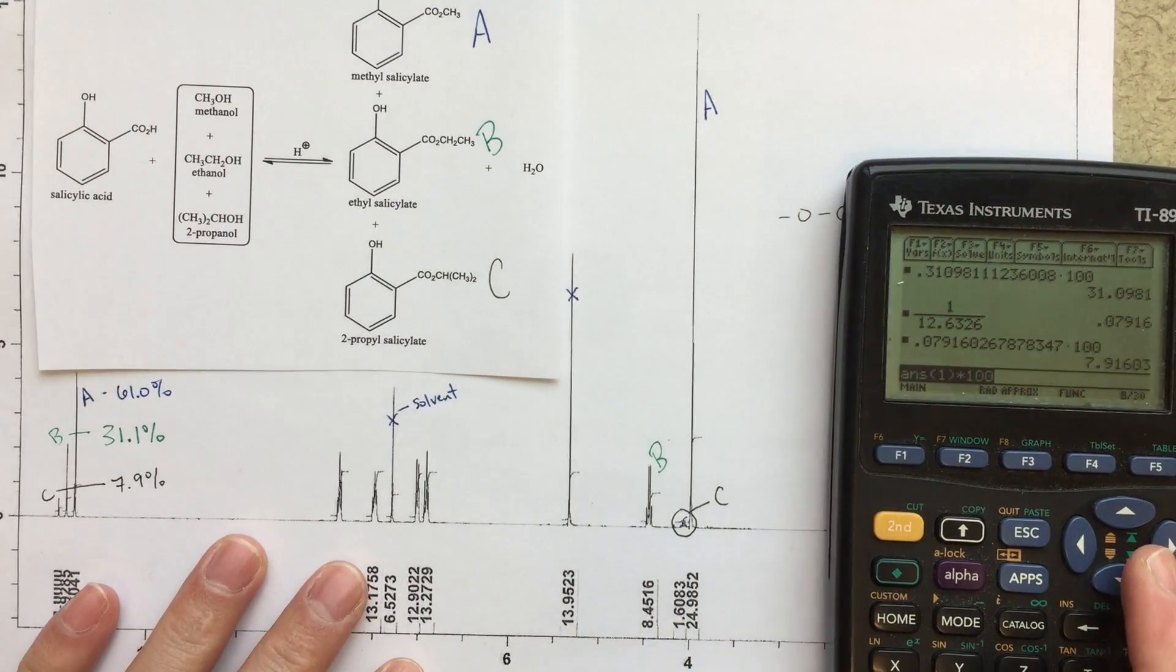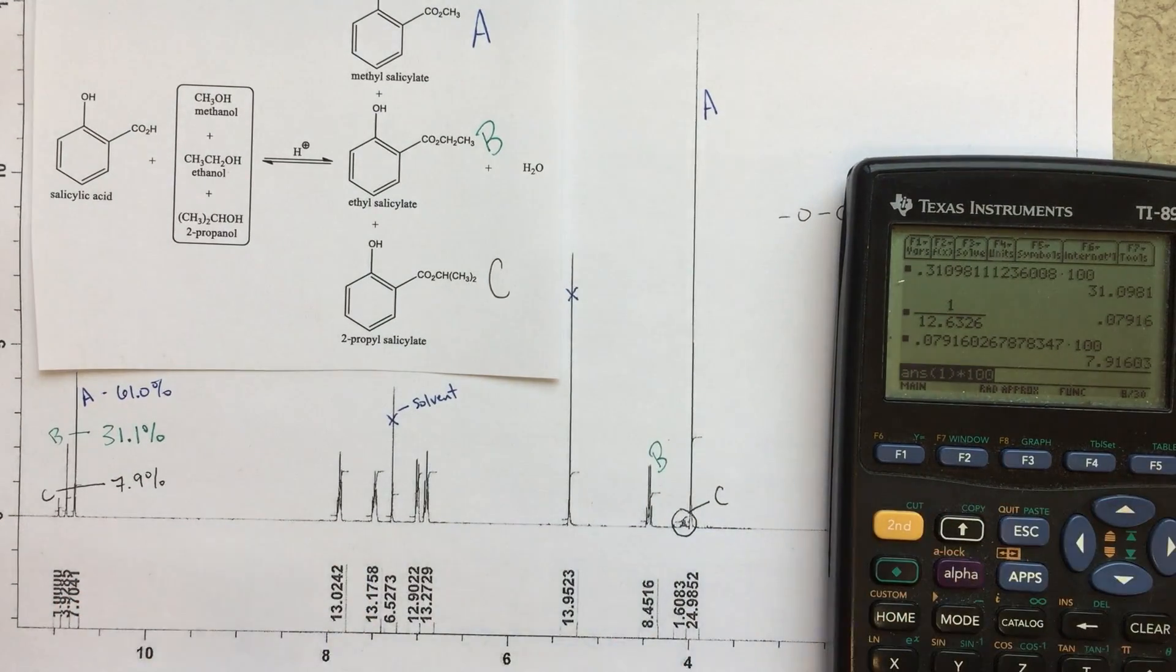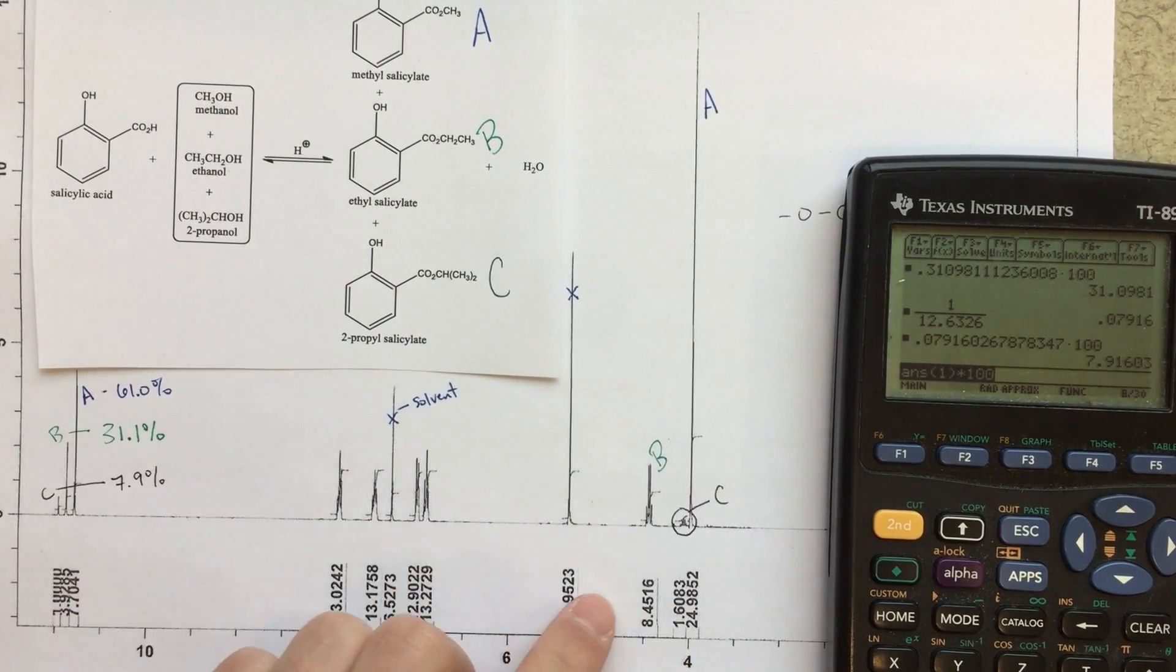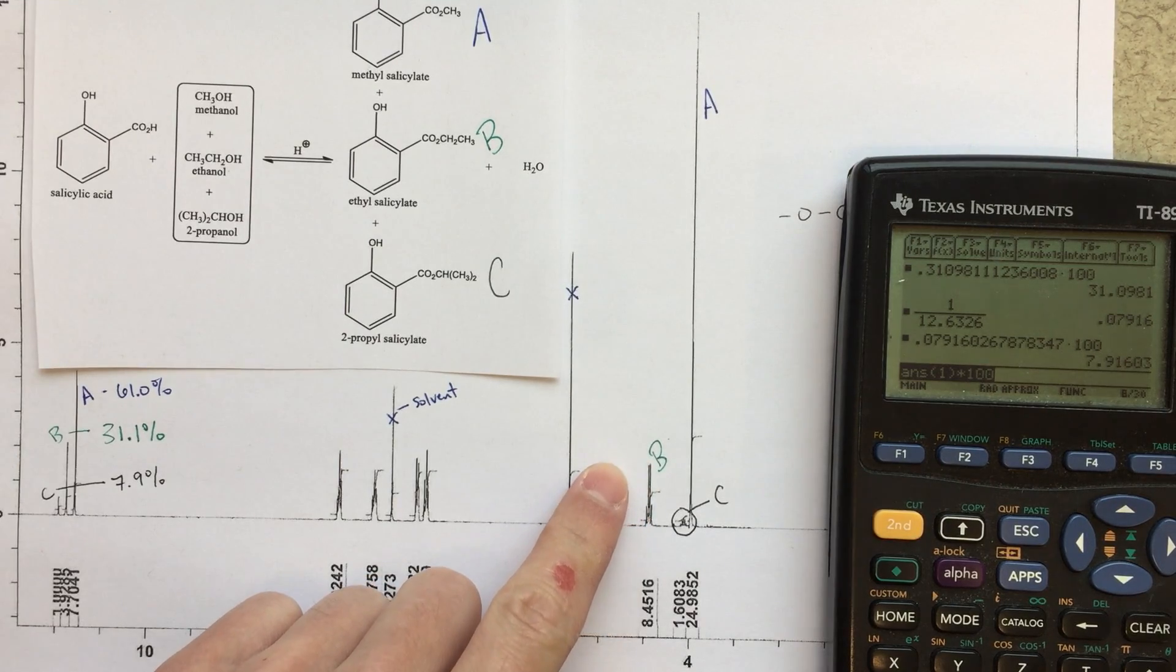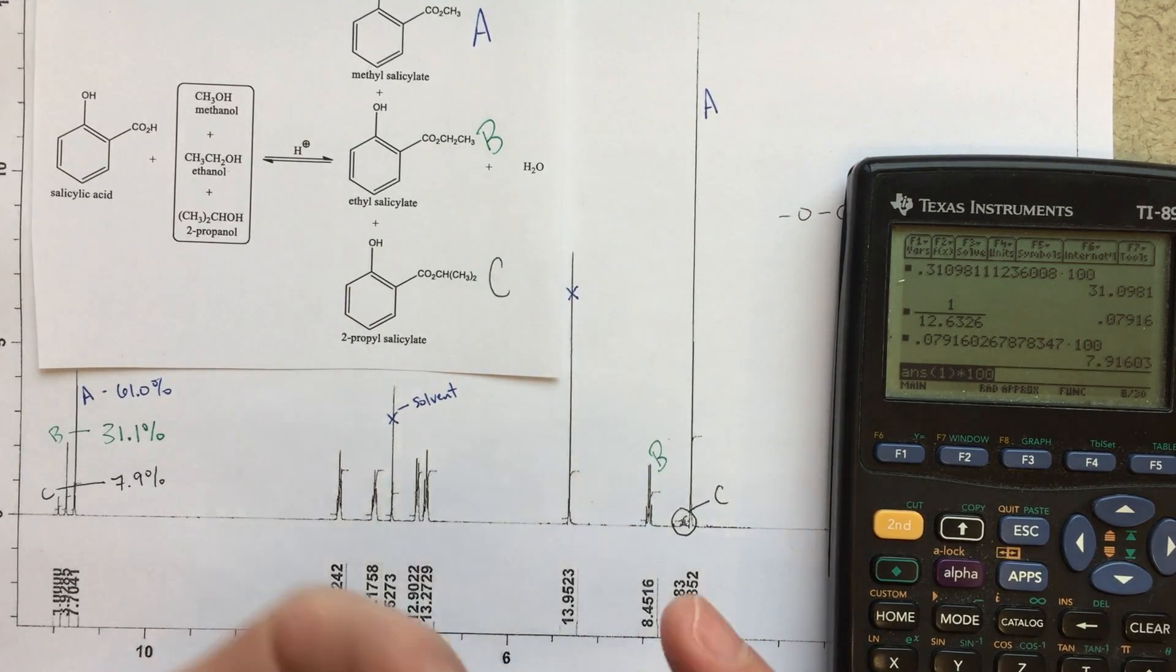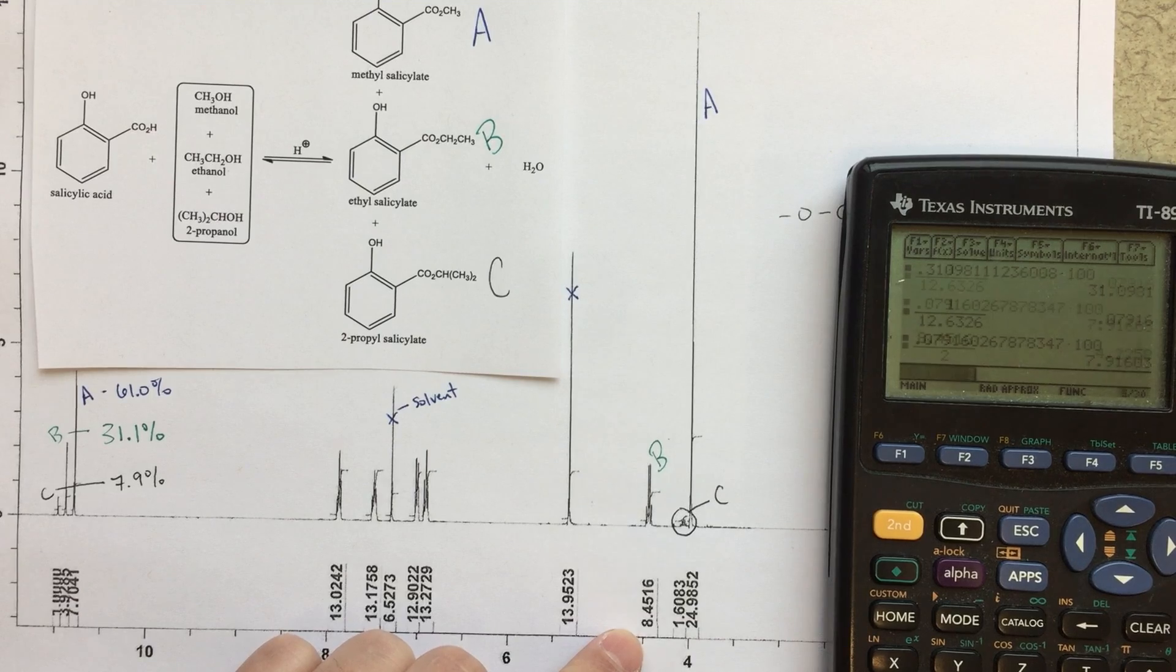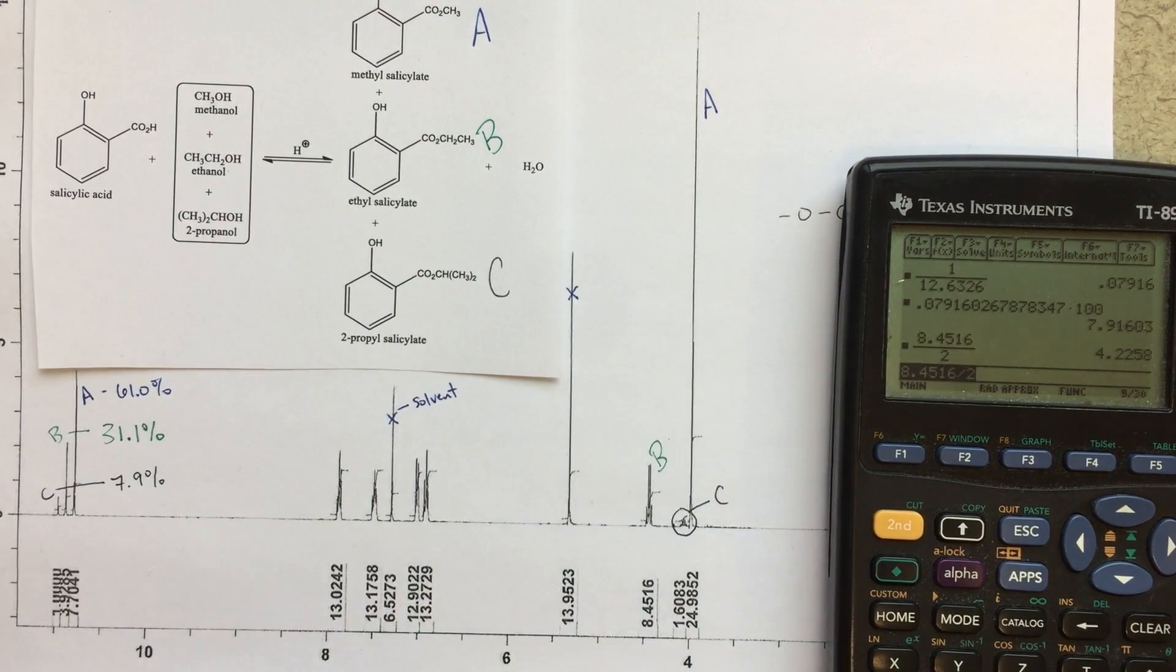So we would need to sort of standardize or take that into account as we're doing this process. The way that I would do that, and I don't know that this is totally necessary, but it's just an interesting thing to do. I would standardize each of these to 1, essentially. So if this is represented 2 peaks, I'm going to find what area would be for 1 peak. So the way I'll do that is just take 8.4516, and I'll divide that by 2, the number of protons. So that sort of changes this number. Not really changes, but standardize it.